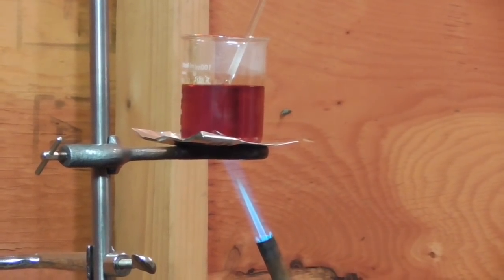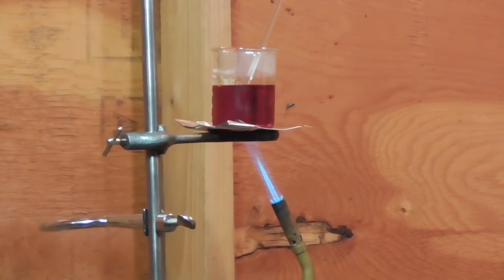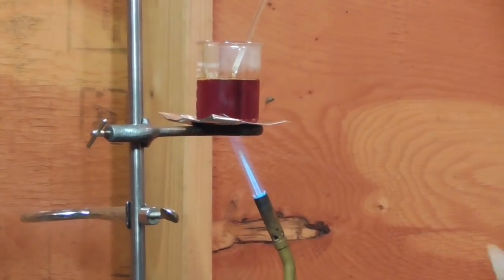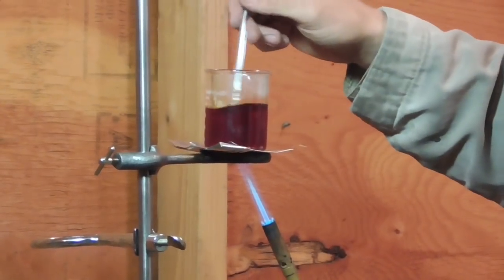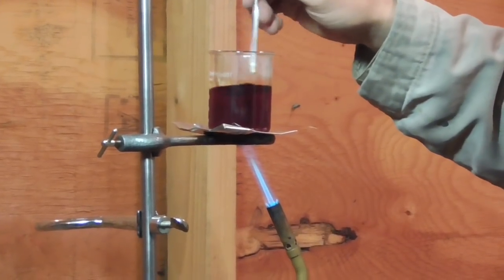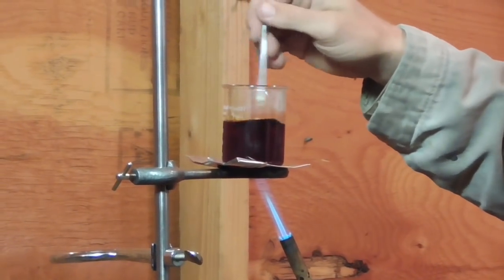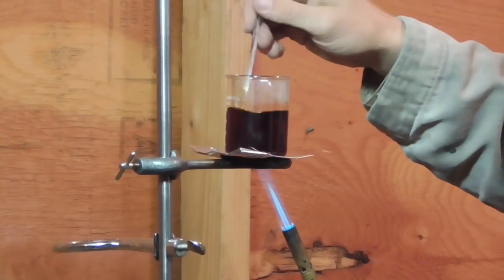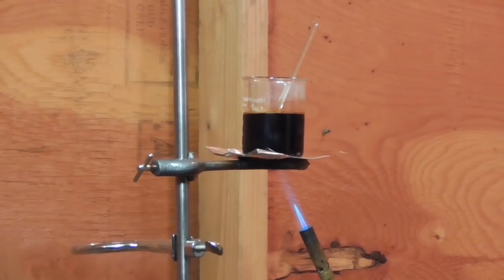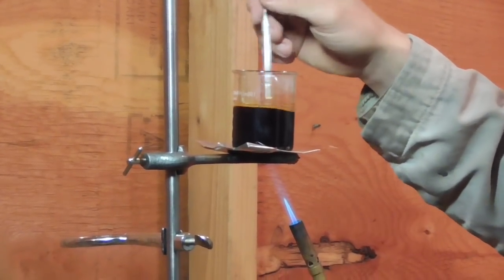Let me add a little bit more sulfur. The addition of more sulfur definitely causes the oil to become darker in color. We're now at 400 degrees. The oil appears to be boiling — or at least bubbling a little bit — so I'm turning down the heat.